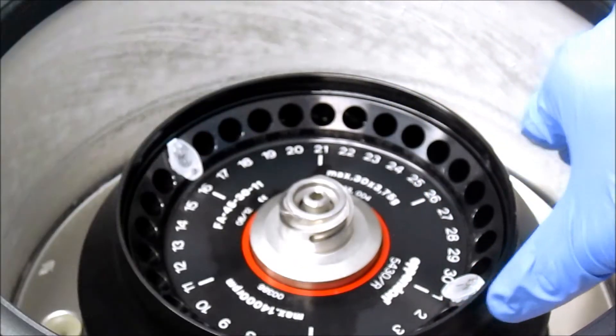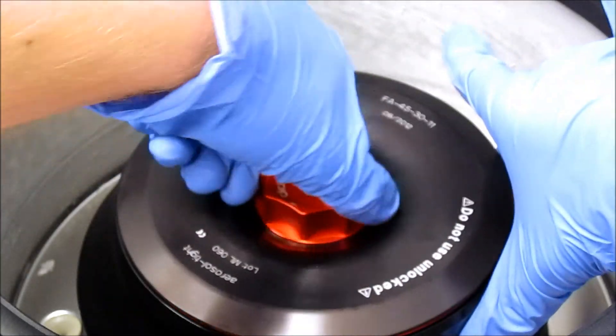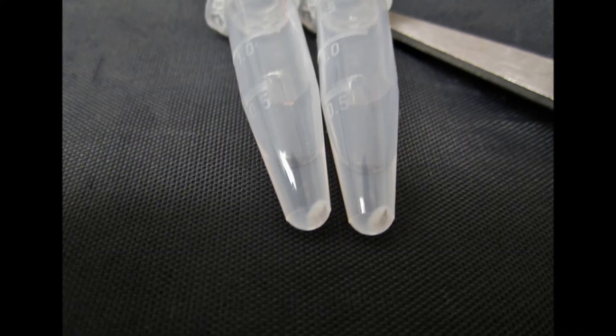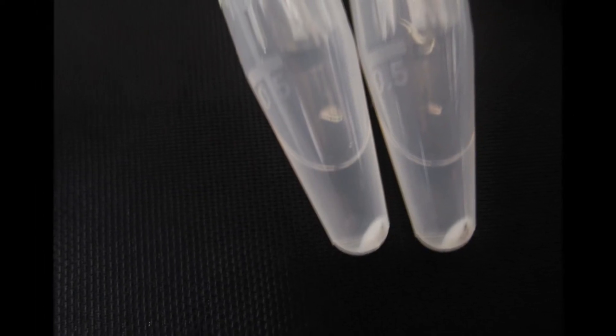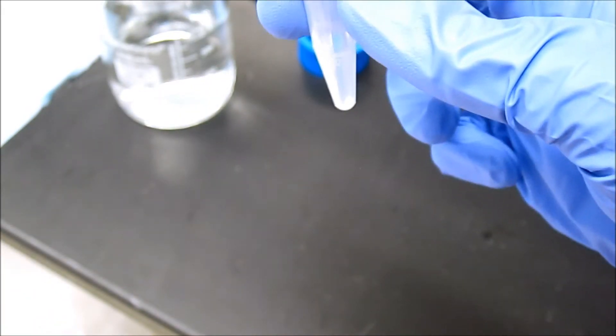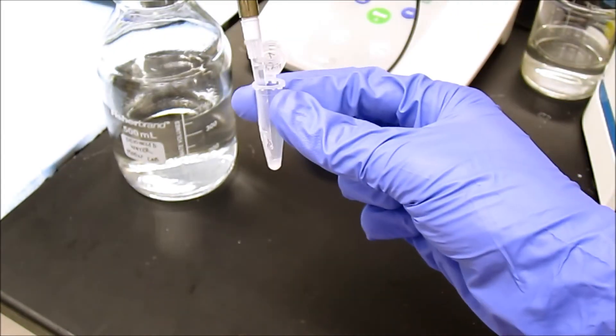The re-suspended liposomes are then centrifuged again using the same settings as before. There should again be a visible white pellet at the bottom of each tube. The washing and centrifugation step is repeated a third time.